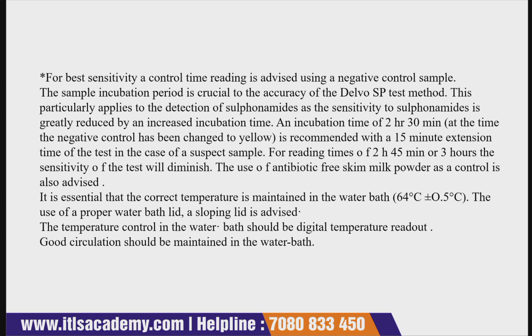It is essential that the correct temperature is maintained in the water bath; the use of a proper water bath lid, a sloped lid, is advised for temperature control. This paragraph is telling you that it is a very sensitive test, so you should be very conscious while performing this experiment in your laboratories to get the correct result.